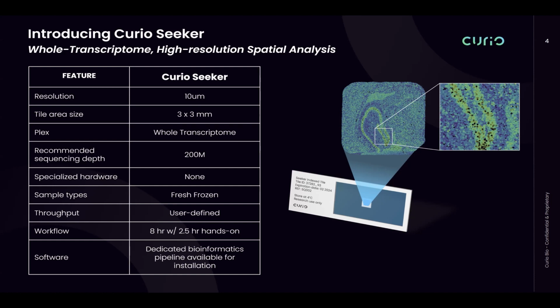And the purpose of this really is just to see if your assay ran correctly, or if your experiment ran correctly. And then you'll obviously go on and do secondary analysis with other pipelines, not commercially, but other pipelines that are available to the public. So the output files that you'll get from the pipeline are just a generic matrix file for whatever secondary pipeline you'd like to use, but you also receive a Seurat file if you decide you want to use Seurat for your secondary analysis.